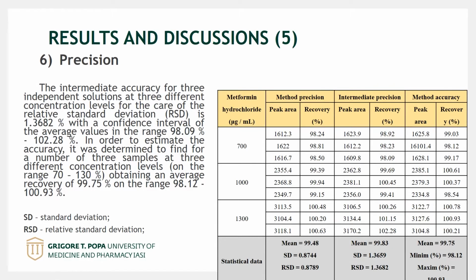The repeatability of the analysis, the precision of the method, for 3 independent solutions at 3 different concentration levels, the relative standard deviation is 0.8789% with a confidence interval of the average values in the range 98.81% to 100.16%.